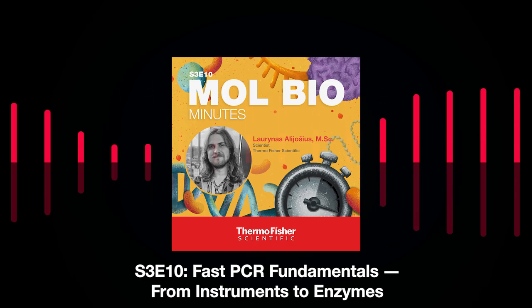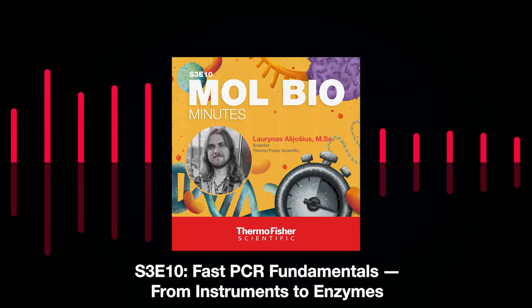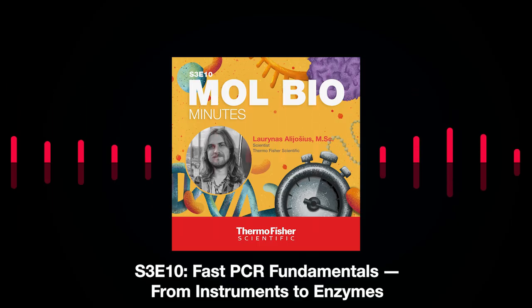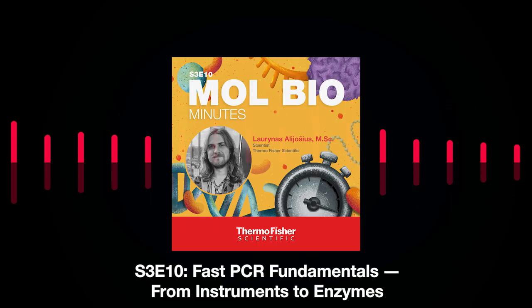So for example, if you want to do fast PCR, you might want to choose plastic that has 0.1 milliliter volume, while conversely for standard PCR, the volume of the wells is usually 0.2 milliliter.